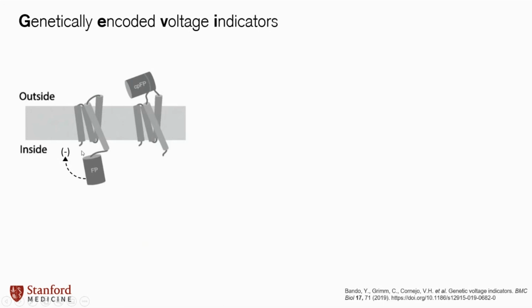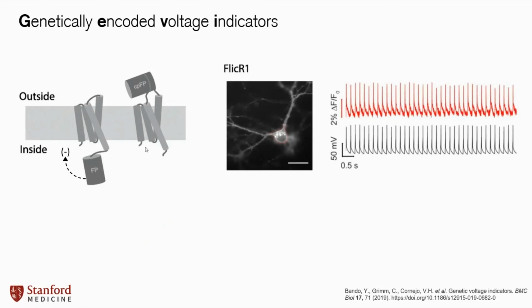There are rotational shifts in some of the bonds of these GEVI indicators, and that actually changes how much they will fluoresce in response to an excitation. So here you can see the Flicker 1 genetically encoded voltage indicator, and over time when this neuron is spiking you get this really high resolution millivoltage change. On the bottom, they're doing a patch recording while they image this indicator, and you can see that even optically, it's highly faithful to what's happening electrically.